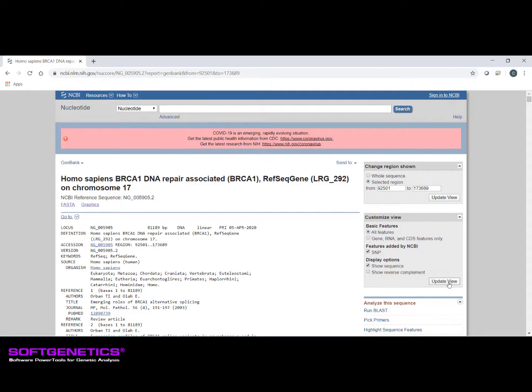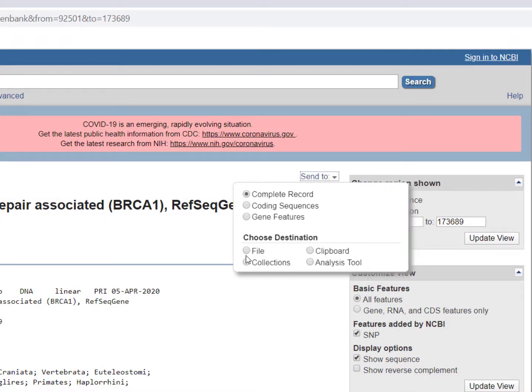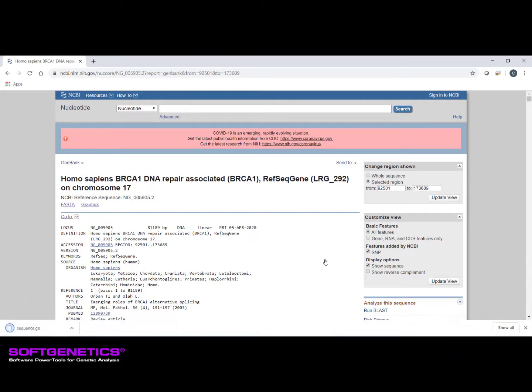When you are ready to download the file, navigate to the Send option at the top of the page. Select File under the Choose Destination option, make sure GenBank is selected for the file type, and click Create File. The file will save with the default file name of sequence.gb to the folder you have specified for downloads. You can navigate to this folder and rename the file accordingly, or copy the file to another folder you have created for GenBank files.